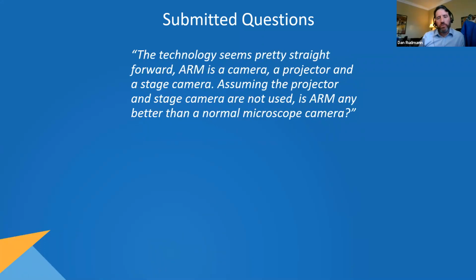Technology seems pretty straightforward. ARM is a camera, projector, and a stage camera. Assuming the projector and stage camera are not used, is ARM any better than a normal microscope camera?